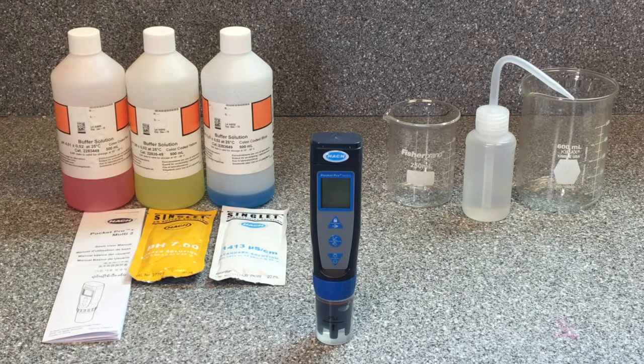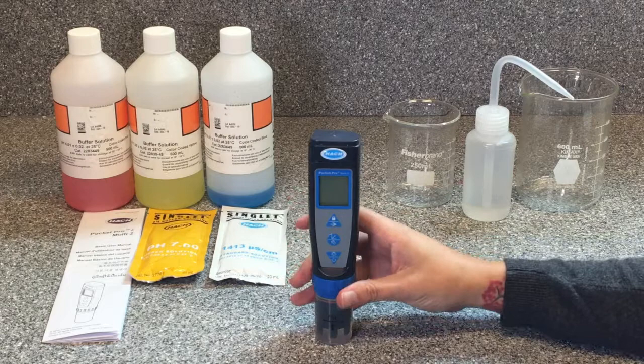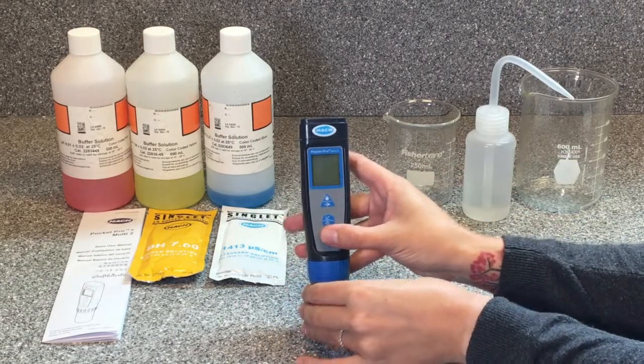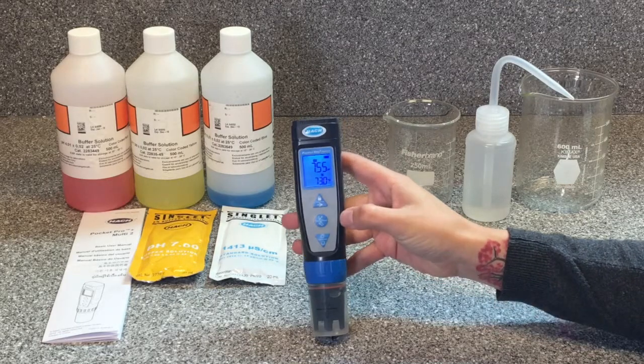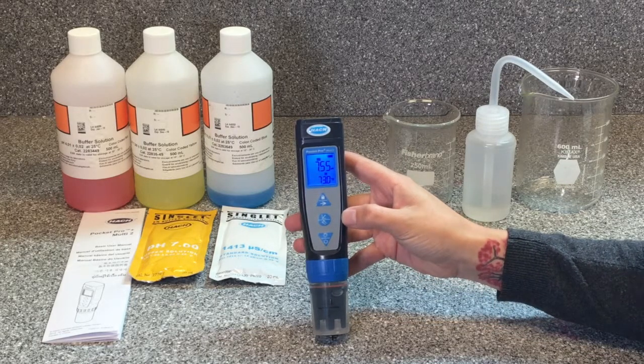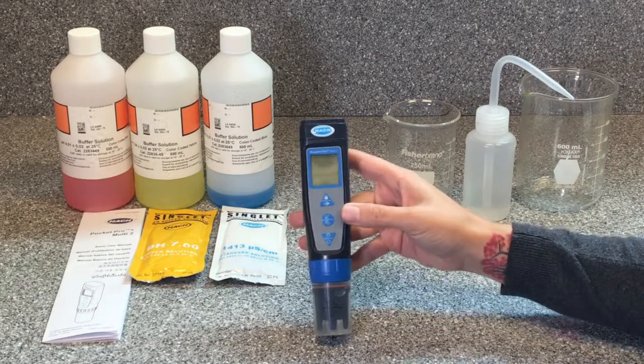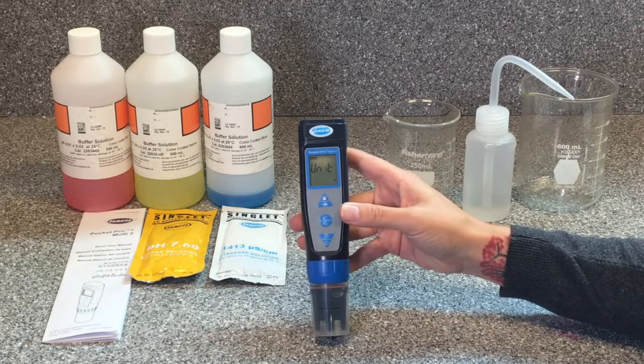Before we begin the calibration procedures, we should check our calibration settings. There are three different calibration settings to check. We'll start by turning on our Pocket Pro by holding the power button. Then we can enter the settings menu by holding the settings button — make sure to hold it until 'SET' shows on the screen. There are several settings in this menu; we just need to scroll through to reach the ones for calibration. To scroll through the options, we push the settings button once.